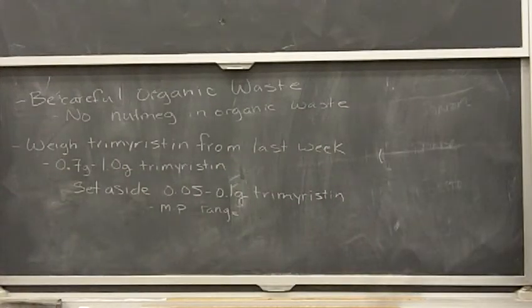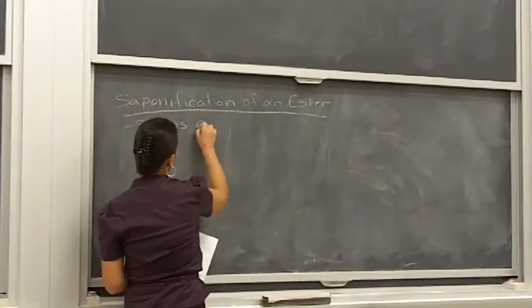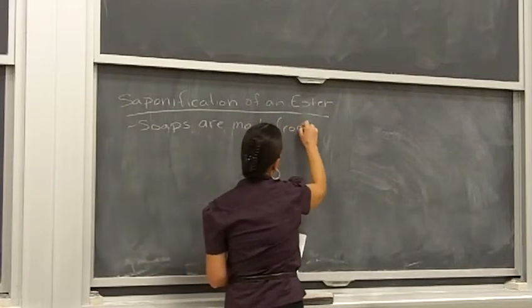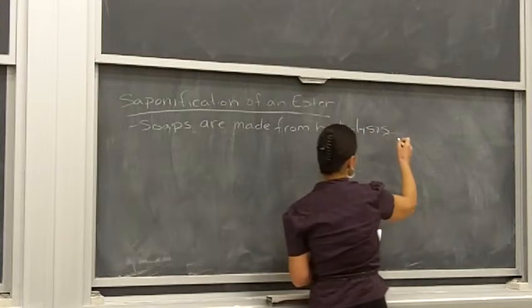So this week in lab, the reaction that we're going to perform is a hydrolysis reaction or saponification of an ester. One common product that is made from this type of reaction is soaps. A lot of times they are made, although more and more they're synthetic, but can be made from the hydrolysis of naturally occurring fats.